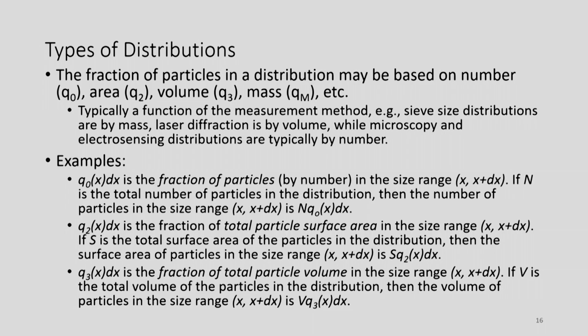Will that be the same in all the cases? Like if you convert from number to volume, there will be one shape factor. Will it be the same if you convert like... No, that's a great question. The shape factor will depend on the type of measurement you are doing. For number based, there will be a different shape factor. Volume based, there will be a different shape factor. I know I didn't include those in there due to time limitation.